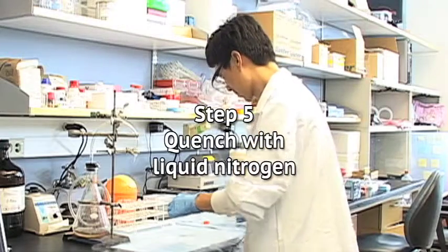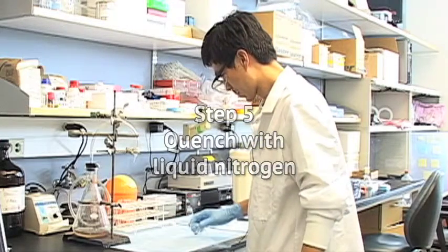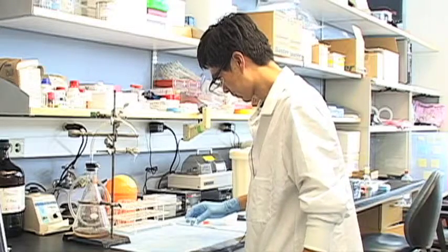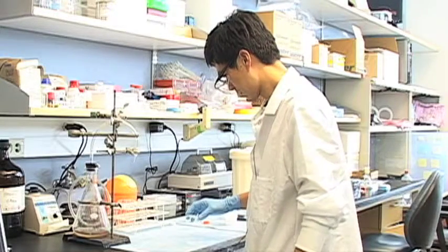Step 5: Quench with liquid nitrogen. After setting the plate on the bench top, pour liquid nitrogen directly onto the surface of the open plate. This will rapidly freeze the cells.